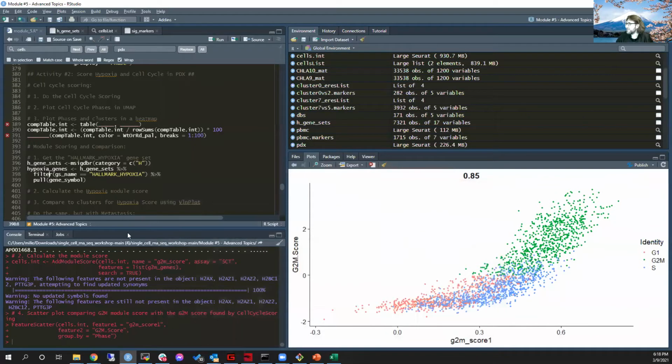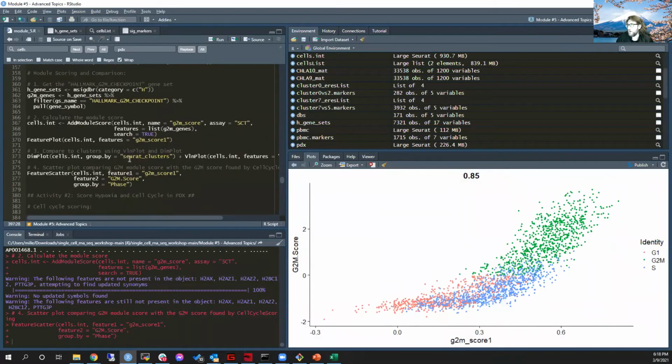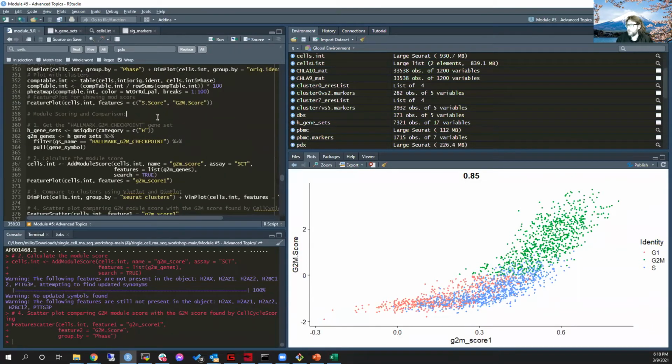All right. So you made a good point, and this is, I guess, why I have to now hedge my statement again, which is that the actual size of the assays isn't the same. While you guys are working on that, I'm going to have a look at this and see why I can't seem to figure out whether this is really appropriate.